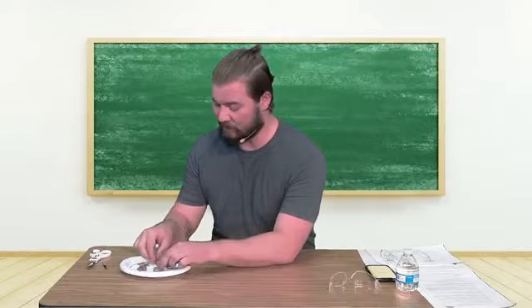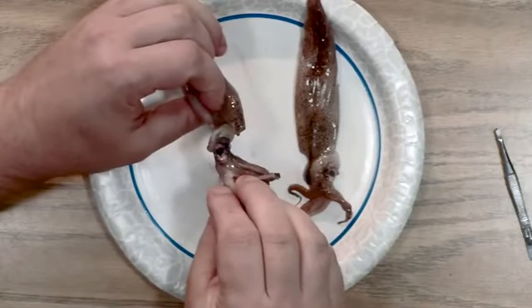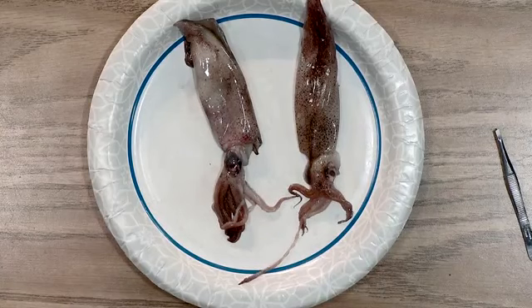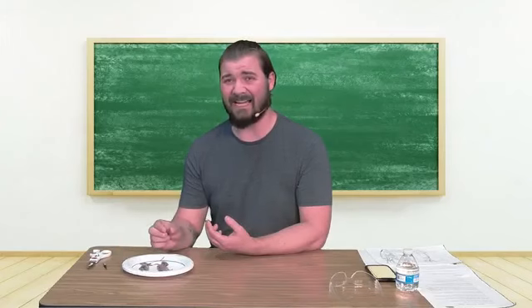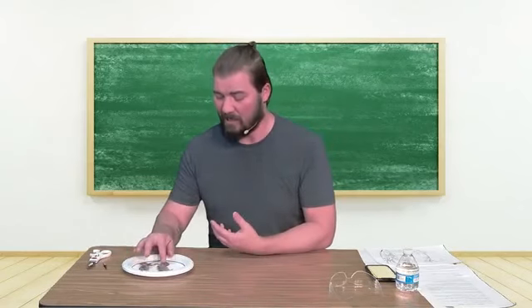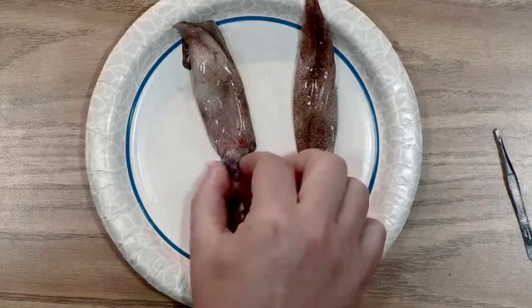So now looking back at this squid, we've seen the siphon there, and we move down. It's got eyes on both sides of the head. Now the eyes of the squid are really similar to the human eye in the sense that inside it's got this lens that helps it focus and see underwater. It's got one of the most advanced eyes of all creatures underwater. And unlike our eye, though, it doesn't have an eyelid that's blinking shut all the time. It's always open like this, but it is protected by a layer of mucus instead, or this thin skin.